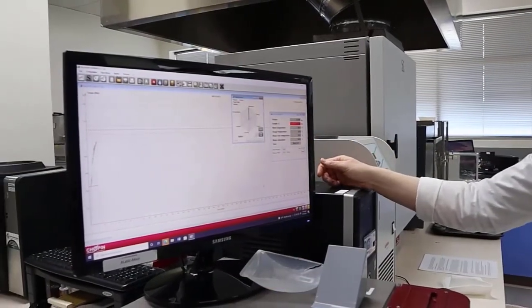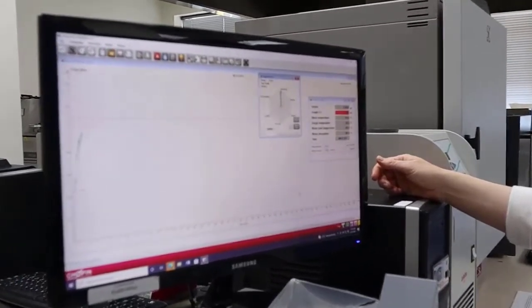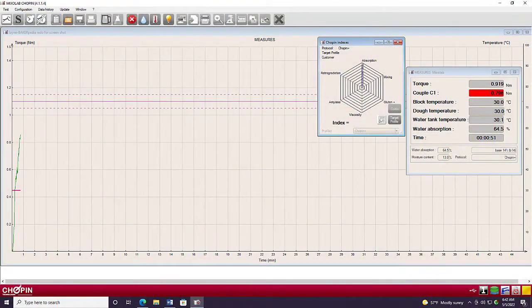And so while the test is running, especially during the first phase where we're holding temperature constant and we're just evaluating the torque profile, the mixing parameters, this C1 torque value will show as red while you're outside of the range. Once you reach the desired torque range between these two pairs of dotted lines, this box will turn green, showing you that you've hit your target torque value.